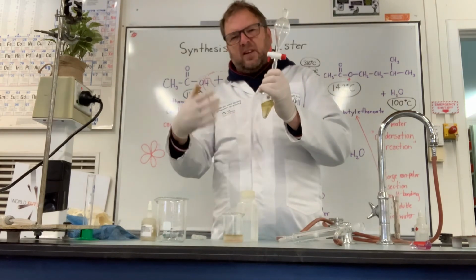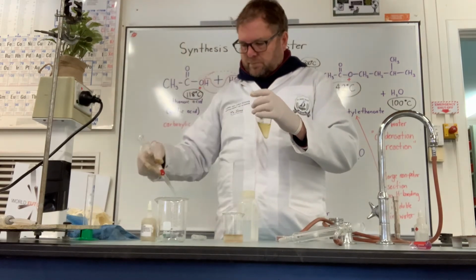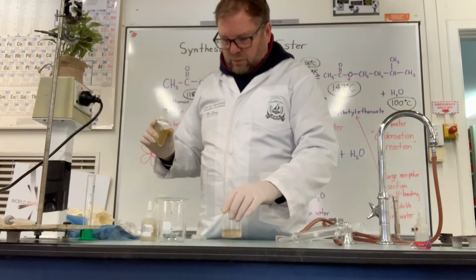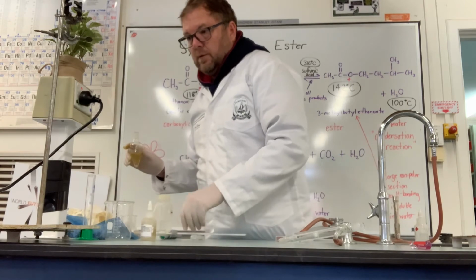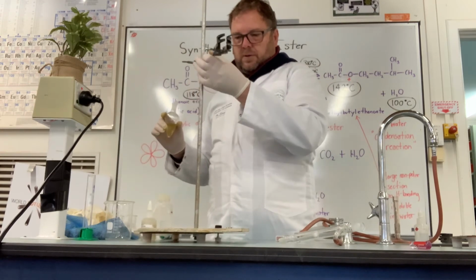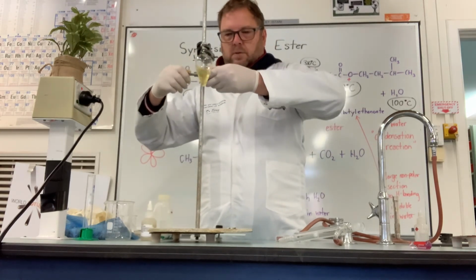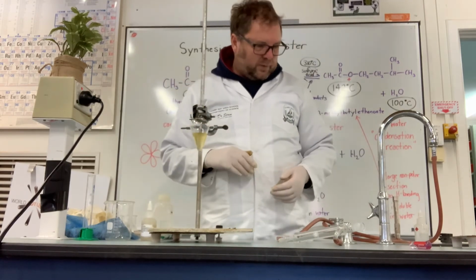We've left the boiling chips in there because, again, we're going to boil this to separate it by boiling point. So that'll just help us control that boiling. And then we are going to start with... got a bit going on here now. Let's make some space. Try and make it so you guys can see that well from the camera. So we're going to put our product from the reaction before.